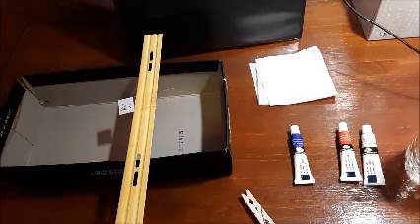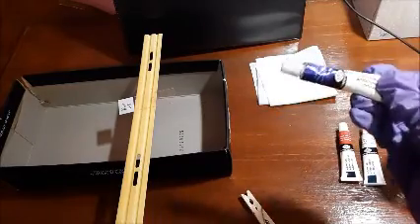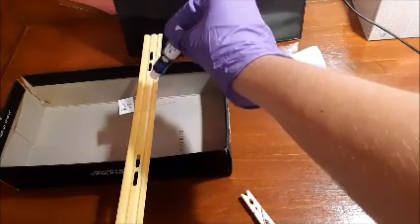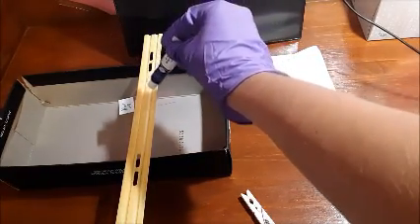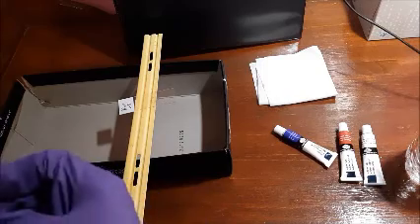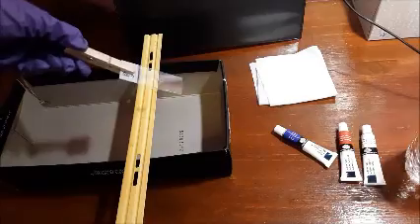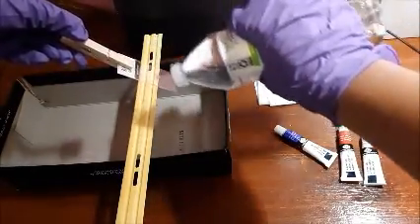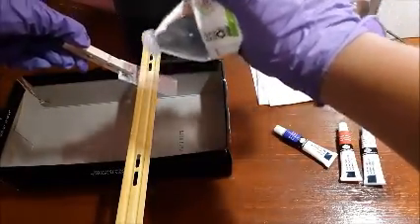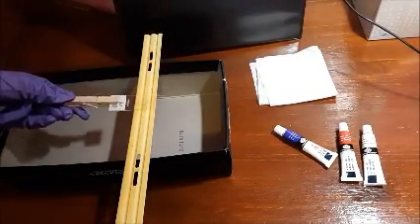Now, your next and final stain for this experiment is to apply methylene blue to your smear. You're going to apply this for about 30 to 45 seconds. Remember, methylene blue is your counter stain. I'm just going to speed this up a little bit. Once you've done that, pick up your slide using your slide clip, tilt it down, and wash off the excess methylene blue stain with water. Rinse it off gently, and put this back down on the stain tray.